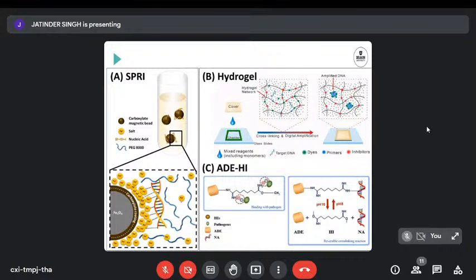In addition to working with a negative charge compensated by the positive charge, there's also cationic amines that can directly, electrostatically, interact with the DNA. It can be bound. If we change the pH from low to high, the positive charge disappears, and that then provides an option to elute the DNA. So DNA is a negative molecule. If you've got any background in ion chromatography, similar binding and elution patterns, where you would use an ion exchange material for solid phase extraction, apply when we do solid phase extraction of DNA.